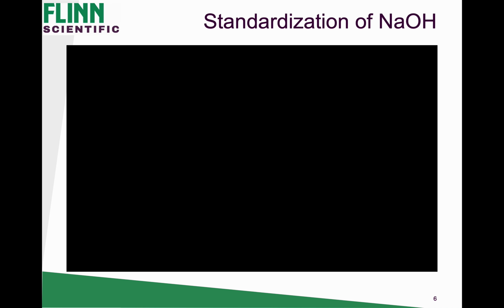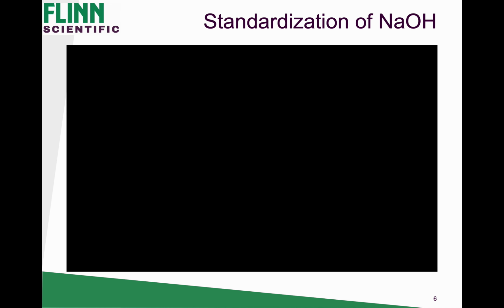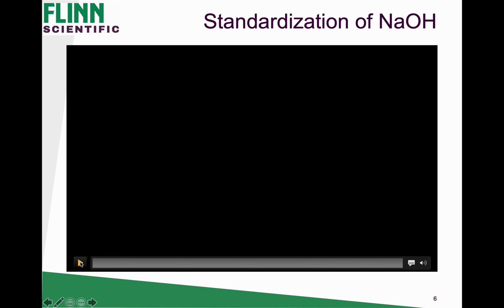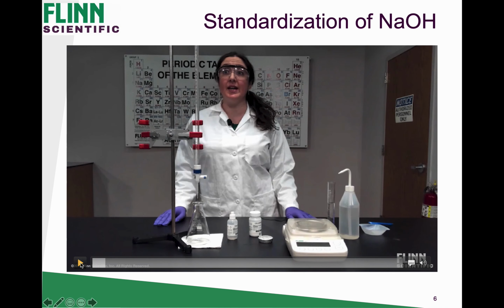Okay, so this very first thing, if you come here, at first it looks like just a black box, but if you go down to the bottom left of the black box, you'll see the little play sign. Start it up. And then this woman here is going to show you how to standardize your titrant.